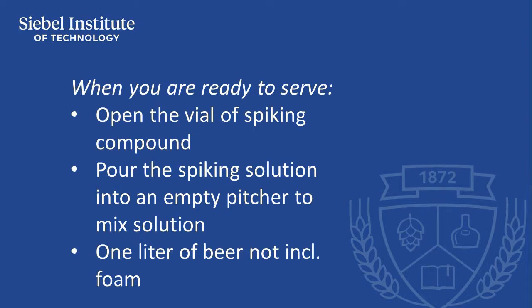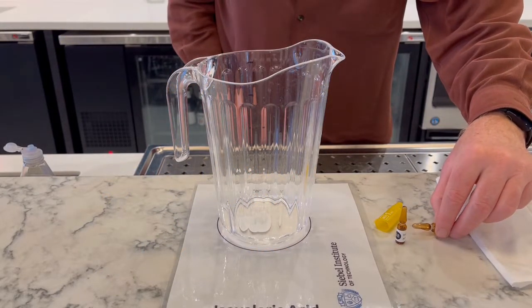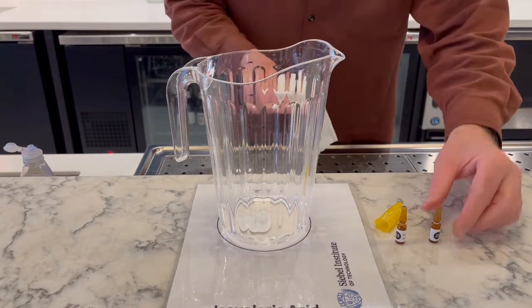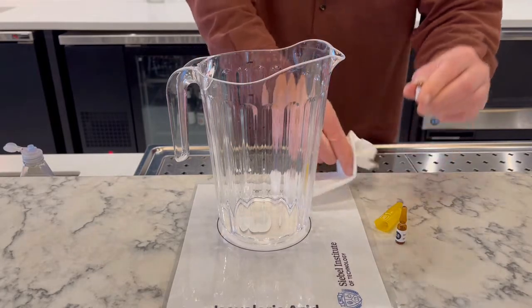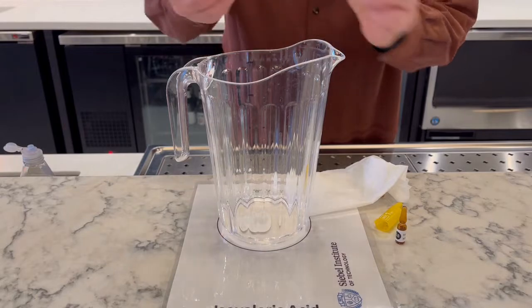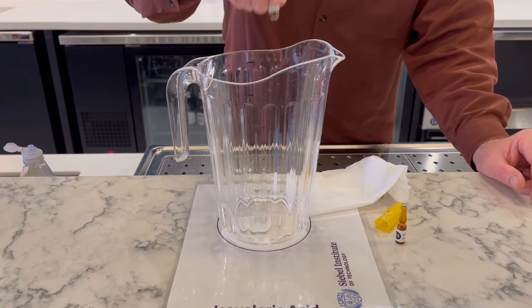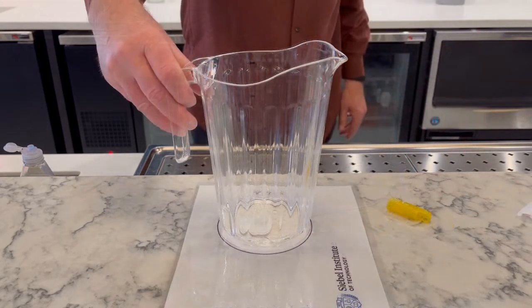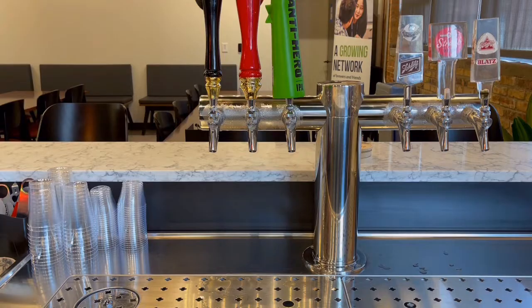When your panel is ready to begin tasting, open the vial of spiking compound and pour it into the empty pitcher. Add beer to the pitcher to reach a one liter volume. Pouring beer into the liquid spiking compound should automatically provide the mixing required to ensure even distribution of the compound in the beer. While the amount of beer added doesn't need to be exact, being as close to one liter as possible assists in making the tasting experience accurate. The one liter volume should be measured after the foam has settled back into the liquid beer.